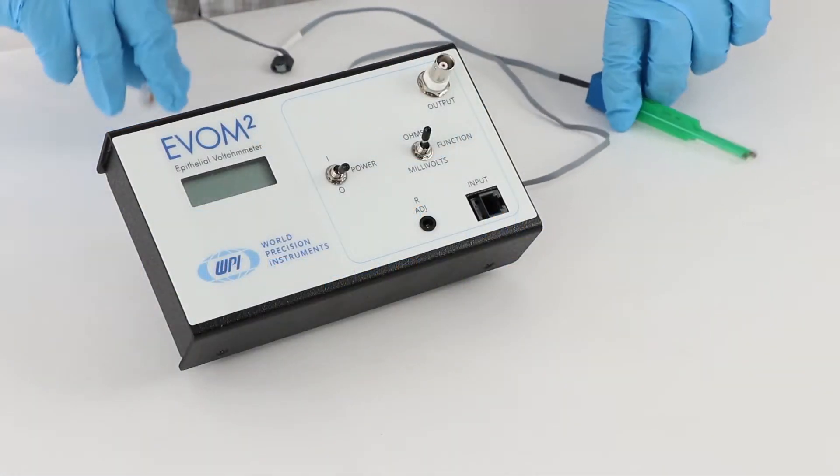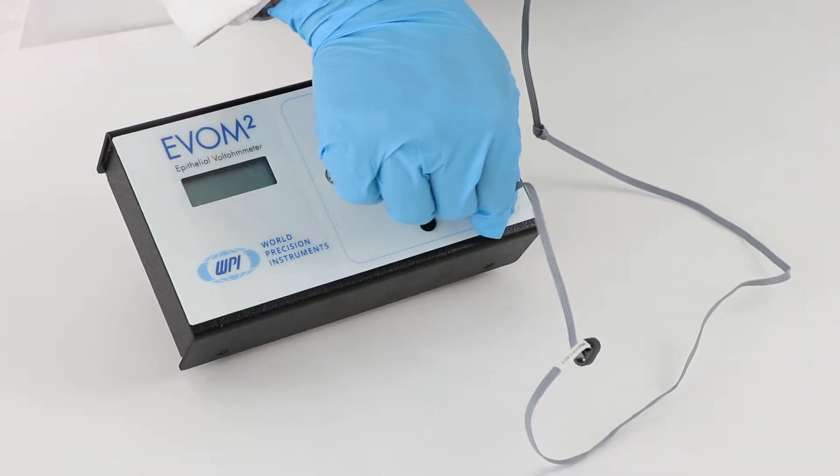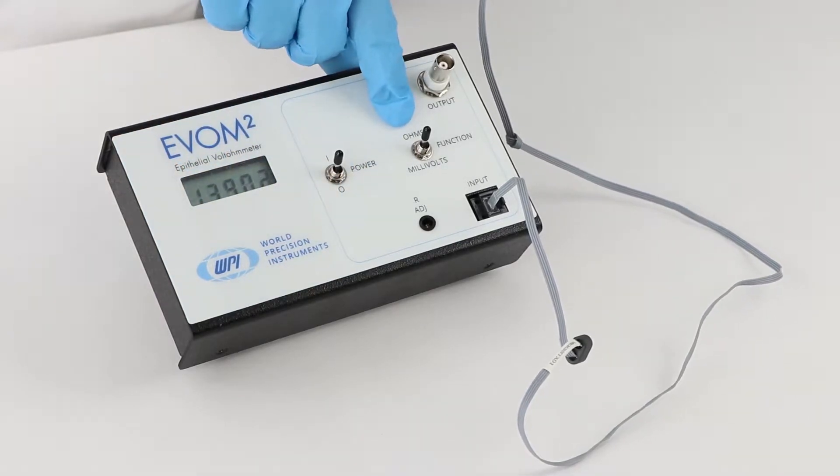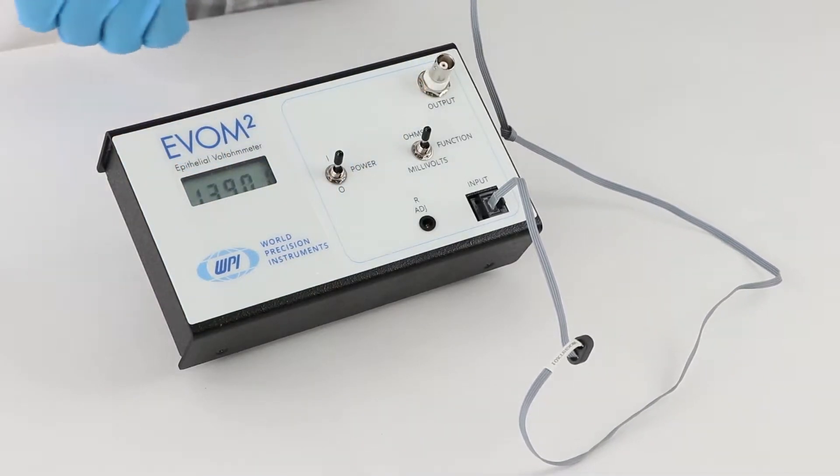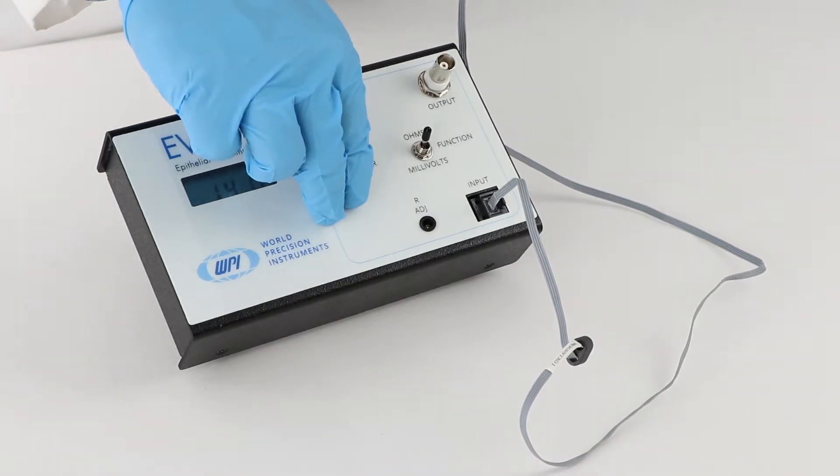First, you will need an EVORM II which supplies very low current, around 10 microamps, to obtain resistance measurements. Now I'm going to talk about different types of electrodes.